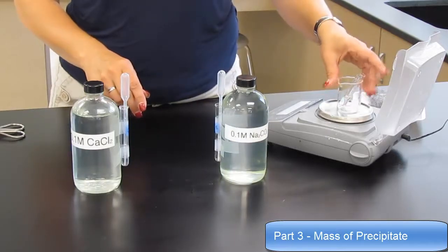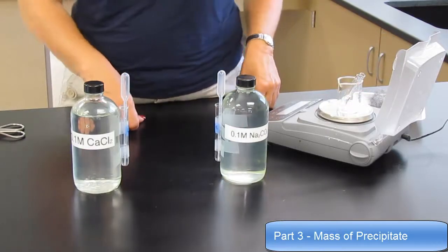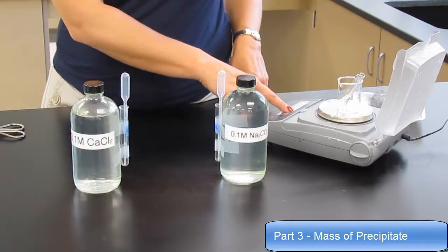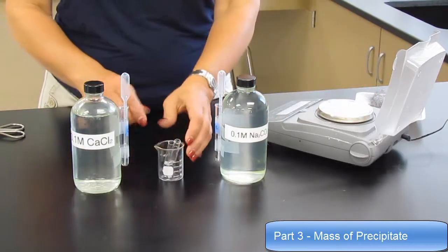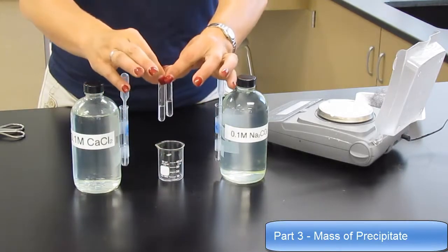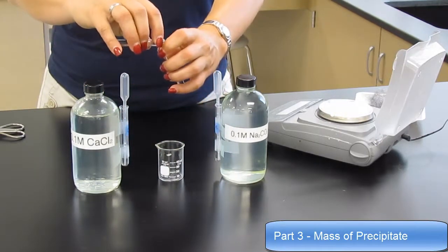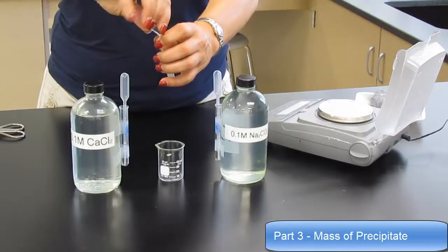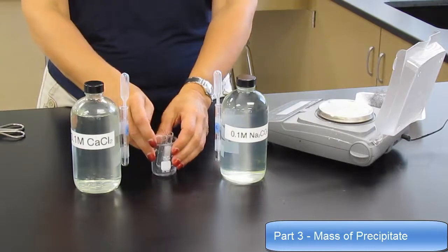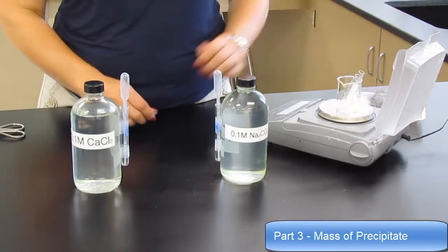Place the beaker with the 2 test tubes that now contain the chemicals onto your balance and take a reading. Then take the 2 test tubes, and it doesn't matter which one you dump into the other, but you're going to pour one of the test tubes into the other. Place both of your test tubes into your beaker, and now take the mass again.